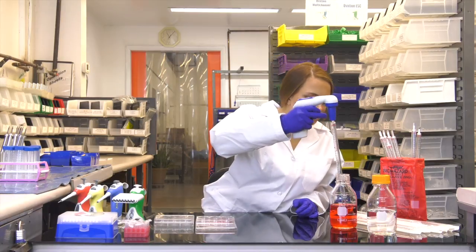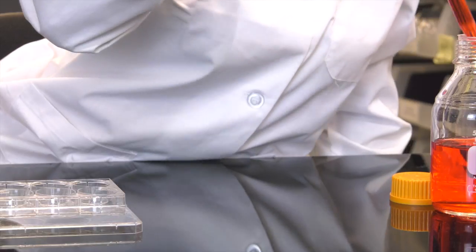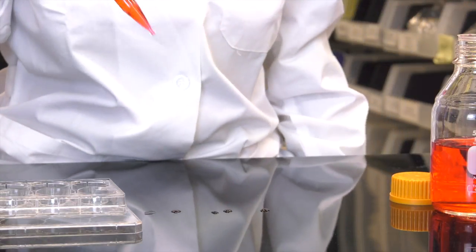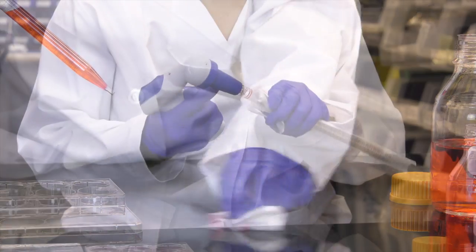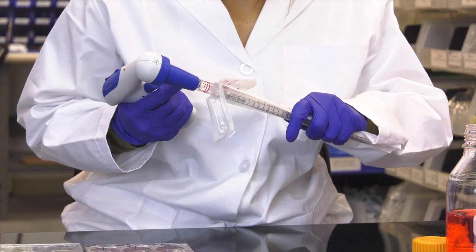We all know this can happen with standard serological pipettes. Drip happens, and you end up compensating by slowing down, causing fatigue and frustration. To stop the wobble, you have to jam.